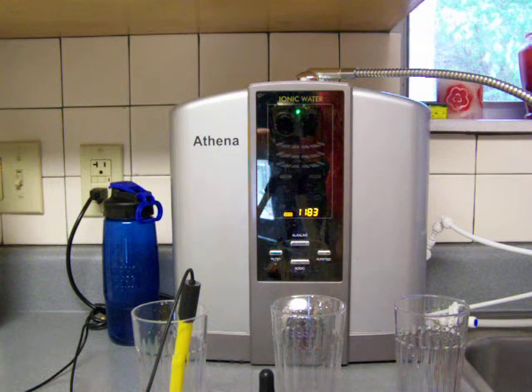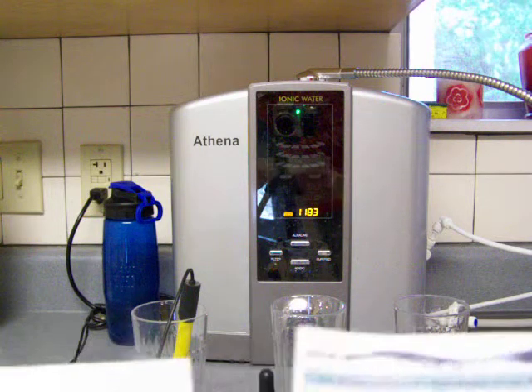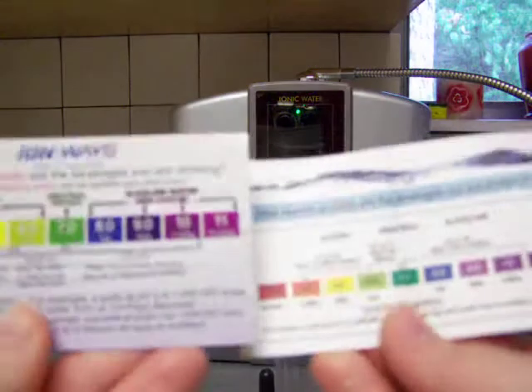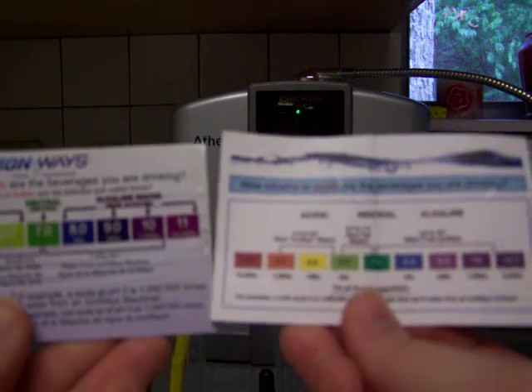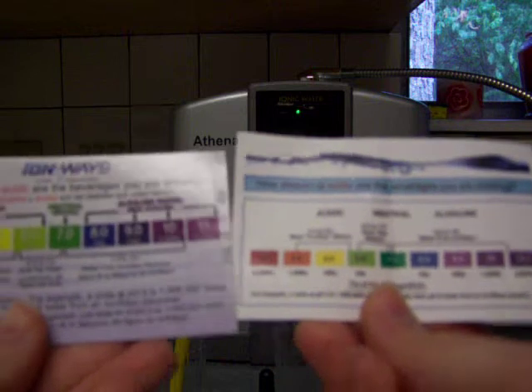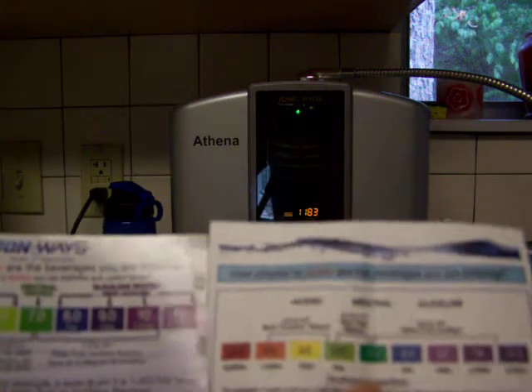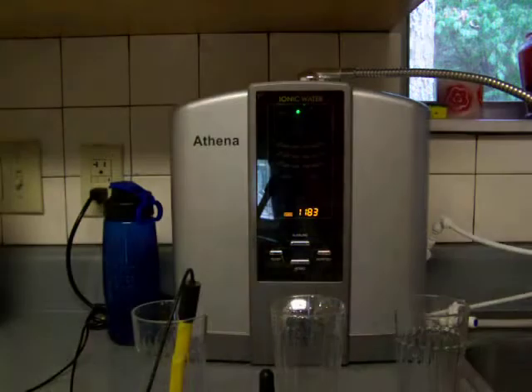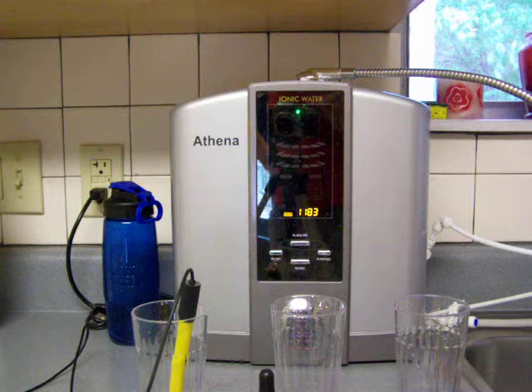As a note, because I noticed this while I was doing this — the color charts are slightly different, so that might be where the difference lies. But in either case, you'll be less confused if you get the smaller bottle than if you get the bigger bottle and try to figure it out. And if you want to read more about pH drops, you can read our blog that goes along with this video.